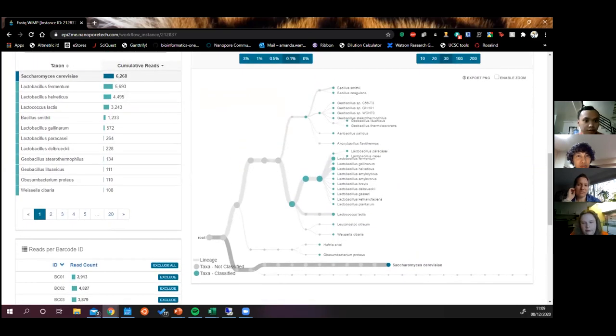So this comes out in real time. Literally every few minutes, as it gets a batch of reads, it'll update this tree and you can watch this tree form in real time. So this is what was happening at the conference: people were watching this come up and guessing what the original sample was. Please feel free to guess. There is no prize this time, but you can guess if you like. But yeah, you can classify based on reads in real time using this.